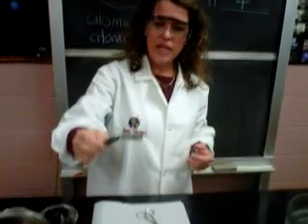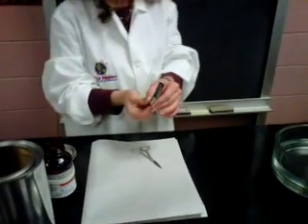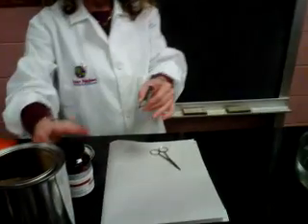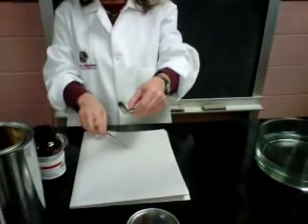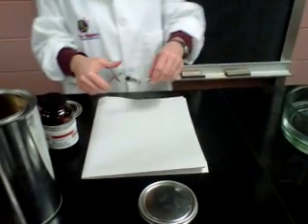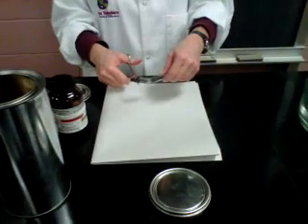What's the liquid on it? It's oil. It's kept in oil. You'll notice that as you keep it out, it goes from bright silver to a gray. I'm going to try snipping it this time. Absolutely, try it. Okay, so the other property of metals is that they're soft, right?